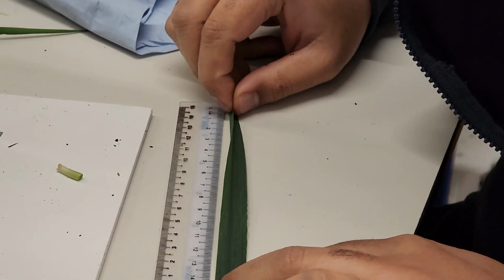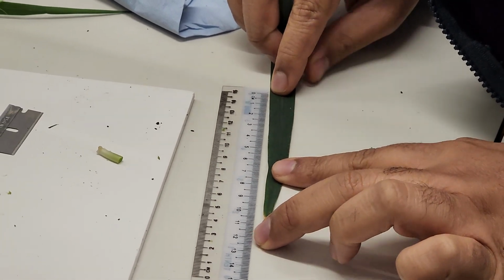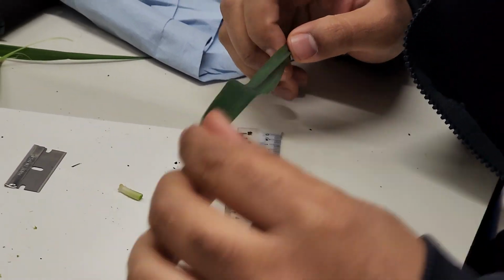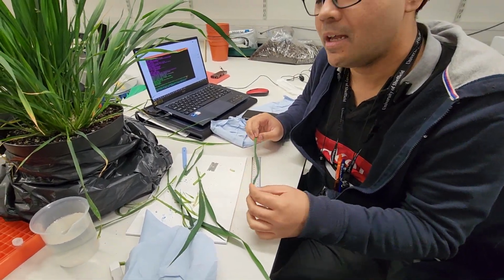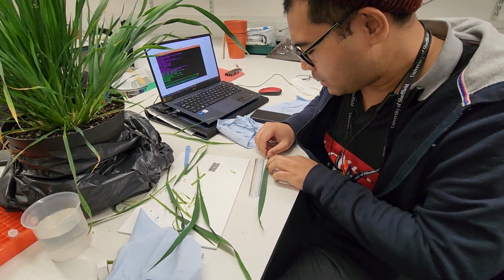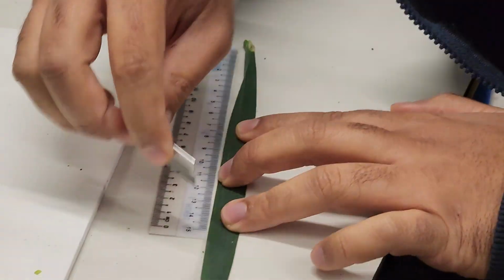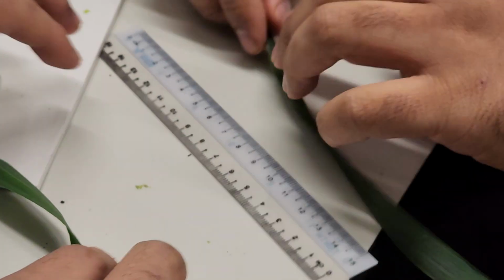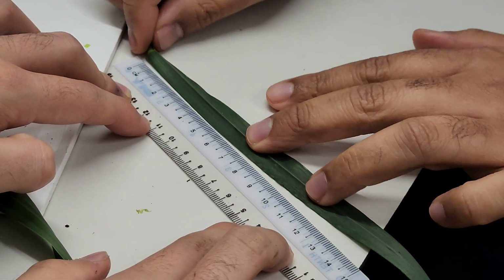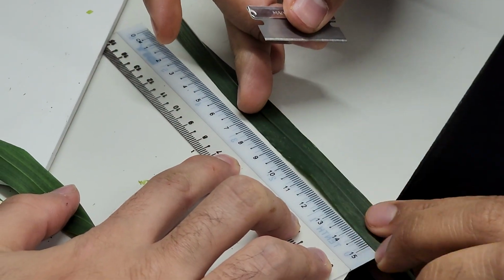So that's 15. 15 plus 13, 28. 28 divided by 2, 14. So we cut it around 14. Can you hold this thing, the ruler, so that I can cut it? So 14 is the midsection.